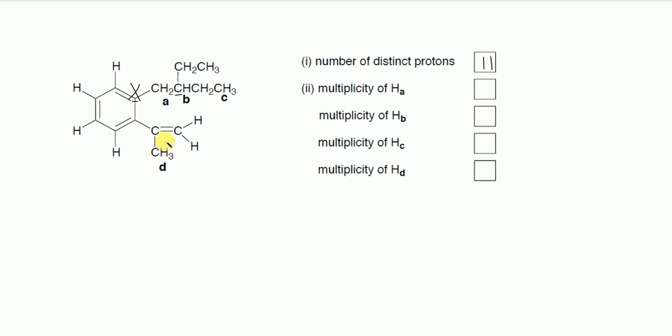Okay, right? And if I were to calculate the multiplicity of this, it would be 0 plus 1, and this would just be 1. And so it doesn't really matter because 1 times 1, you know already. It's not going to contribute or affect the value that comes out of this, okay? But it would be represented by a single peak, right?